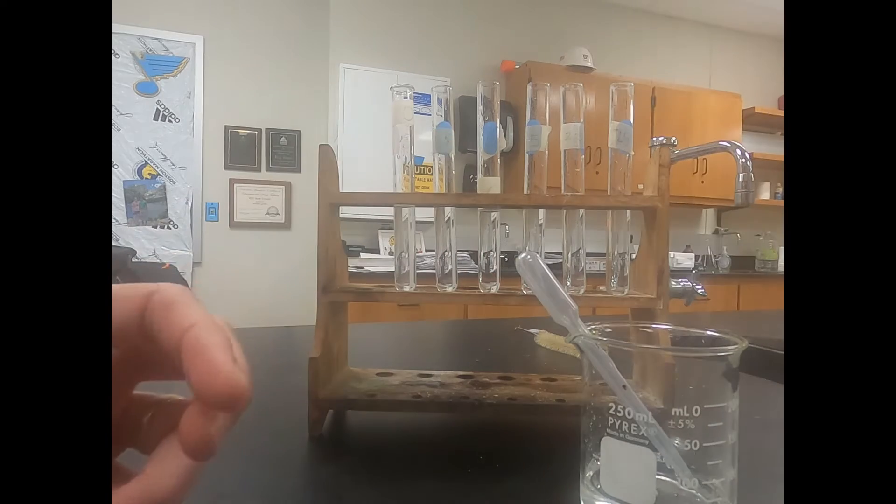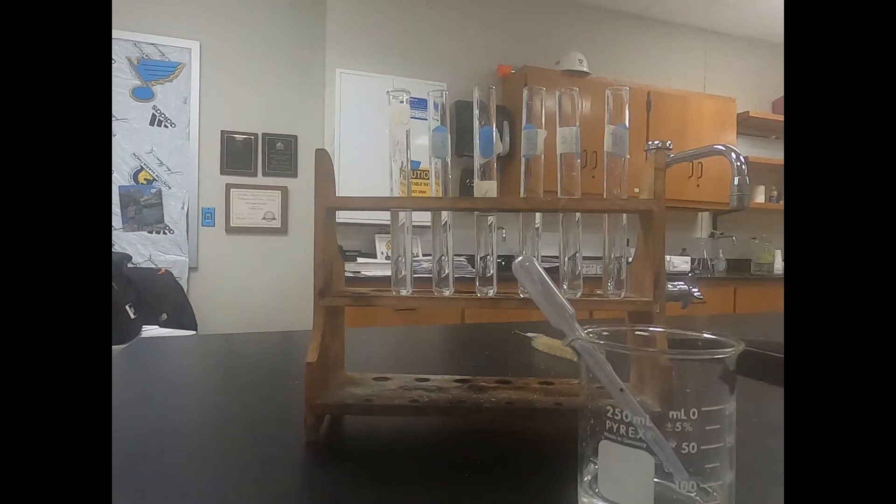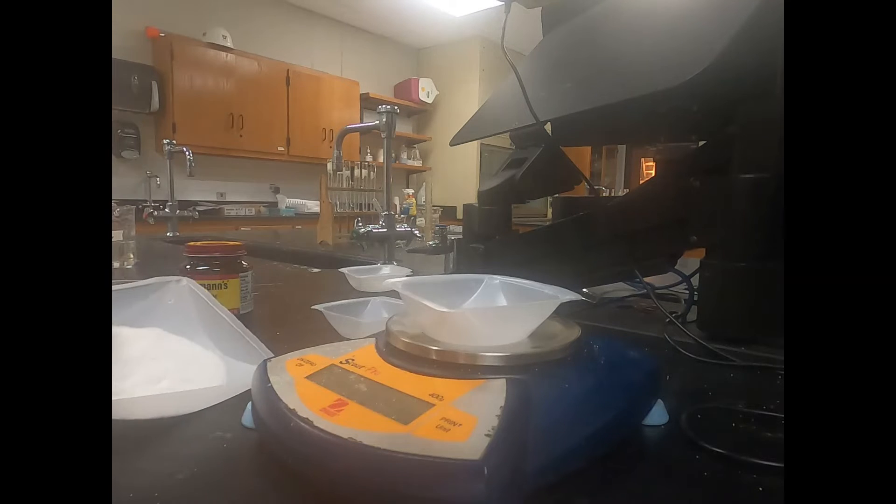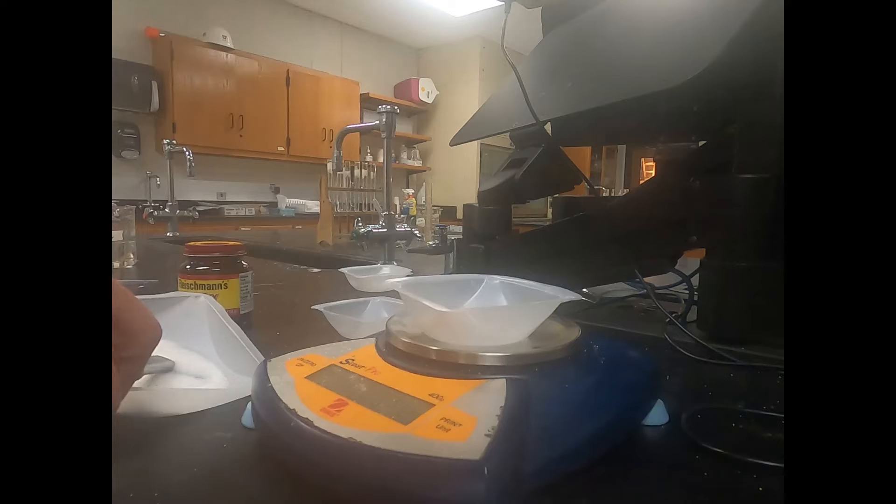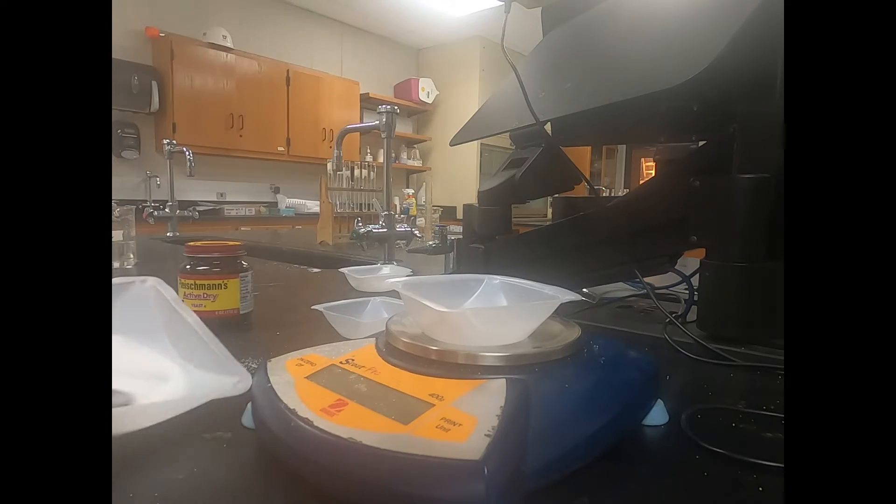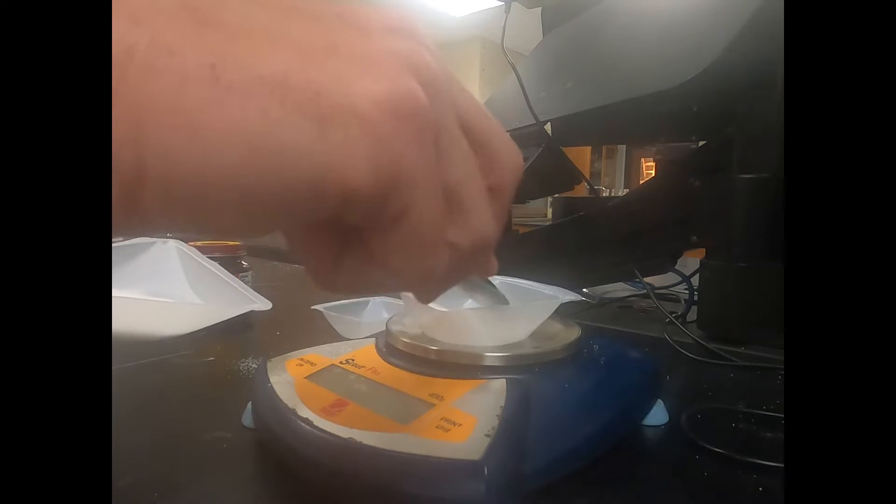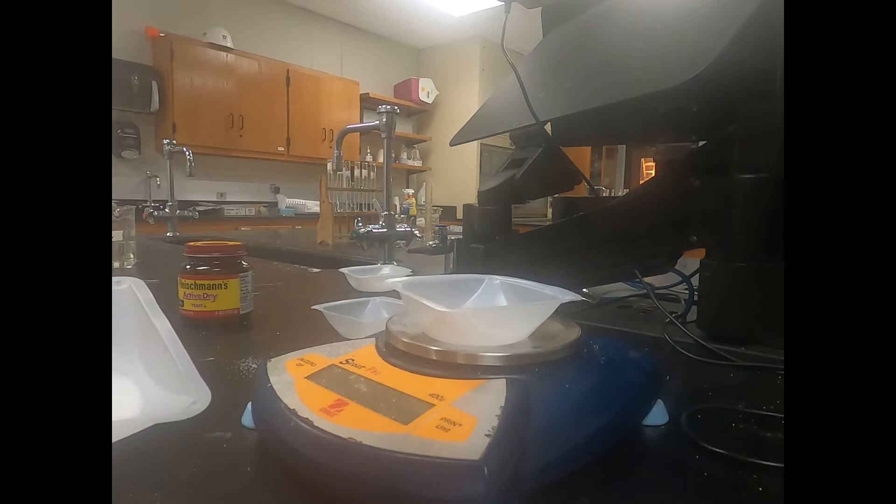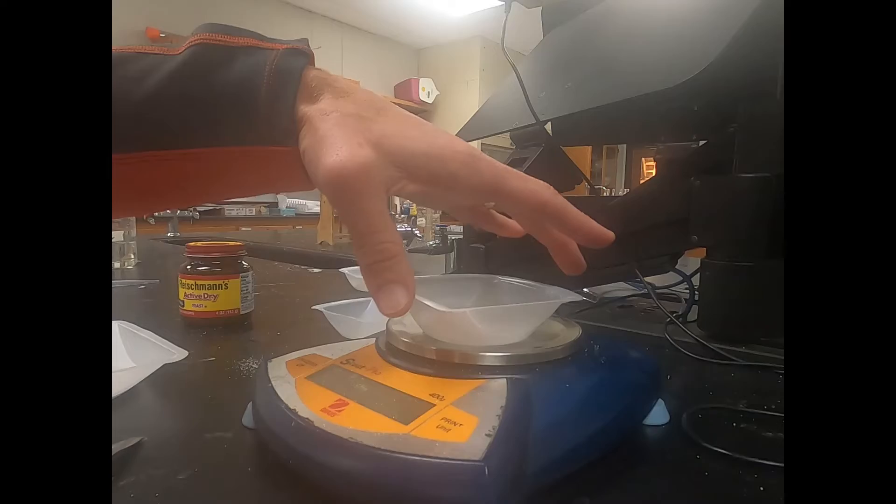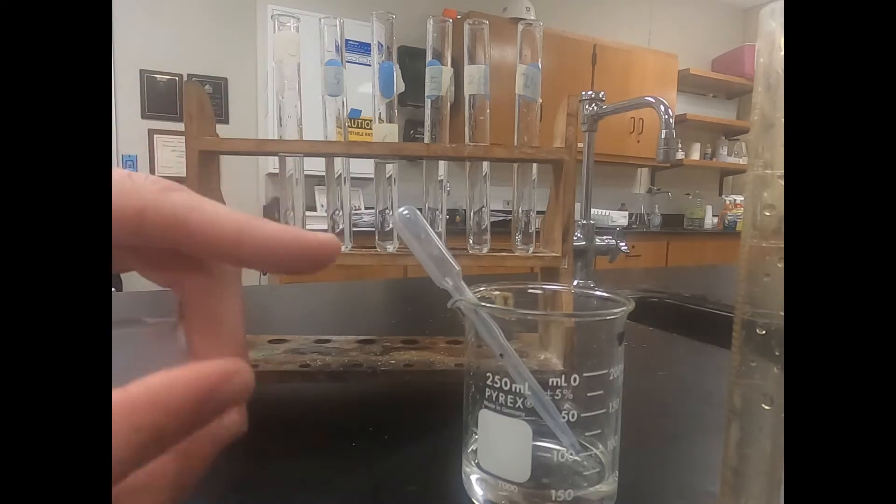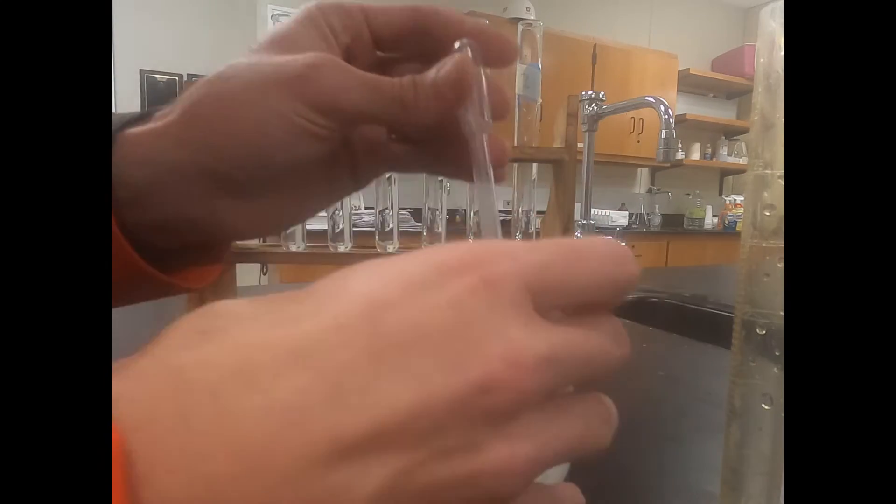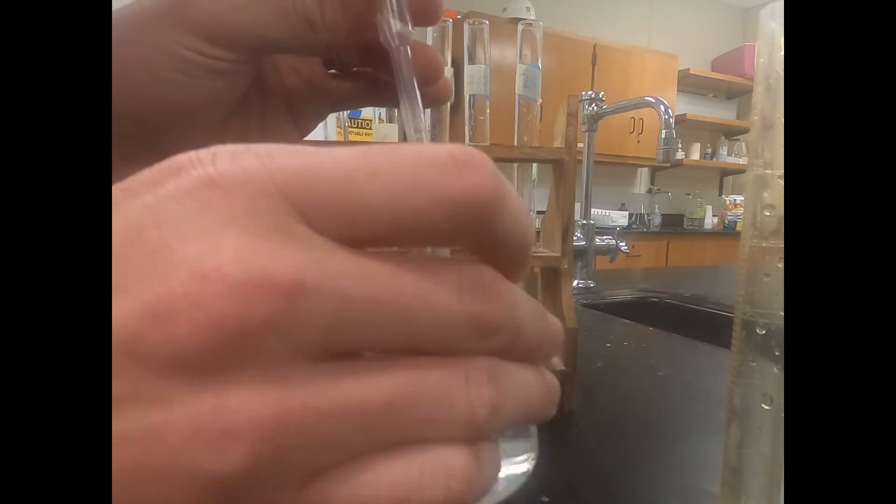Once we have our 50 milliliters of water next we're going to get one gram of sugar. At the scale we'll put our weigh boat on, zero the scale, and scoop out until we have one gram of sugar. It doesn't have to be perfect, but we want to be pretty close to 1.0 gram. 1.04 is going to be good enough for this lab. We pour it in with our water and swirl it around and mix it into our solution.